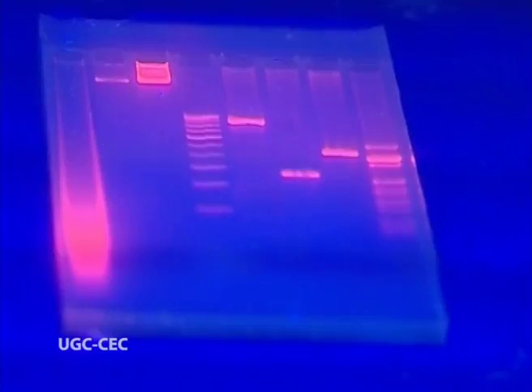The second lane consists of a pure DNA, which is actually pure, with no RNA or protein impurities in it. It is actually a less concentration, but yes, it's a good quality DNA. The third lane consists of DNA which is highly concentrated. You can see that the DNA has not migrated well from the well, and hence it needs to be diluted for further use. The fourth lane consists of a 100 base pair ladder, as we have mentioned previously.